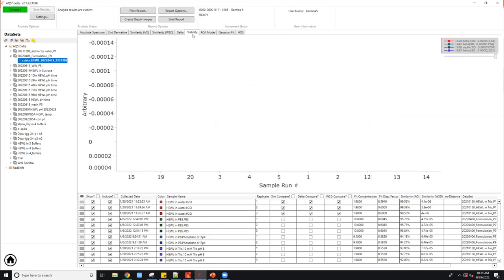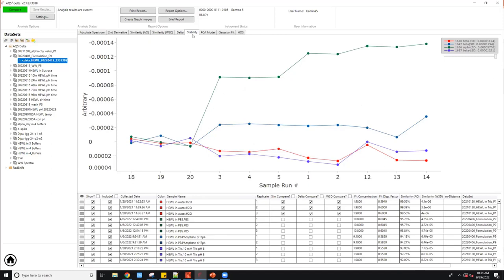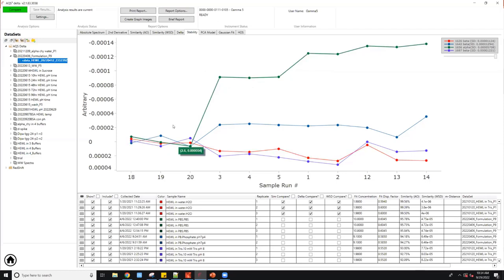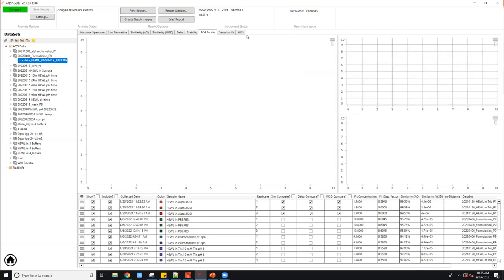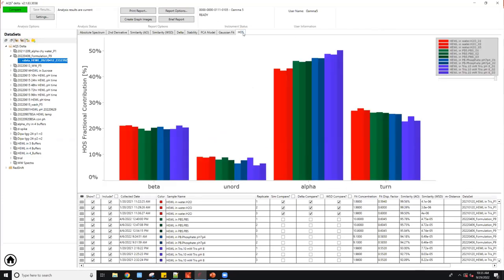If you want to have some numbers, here is a stability plot. You can customize what wavenumber you want to show here. We're showing four colors for four different wavenumbers. For example, this green one is 1656 for alpha helix. If you follow the green one here, this is water and then PBS, phosphate buffer and Tris.